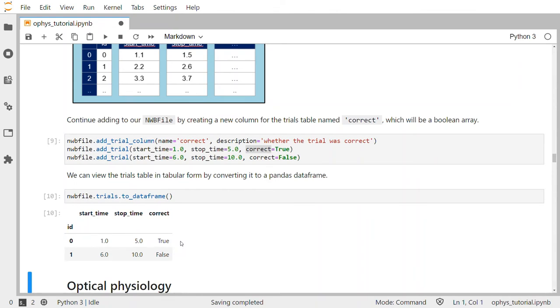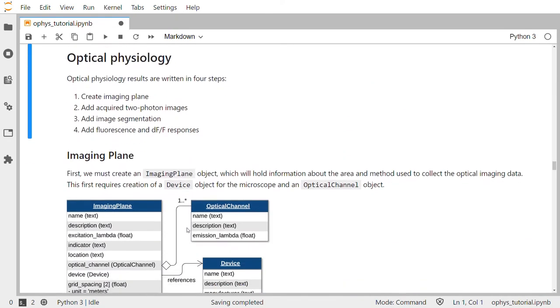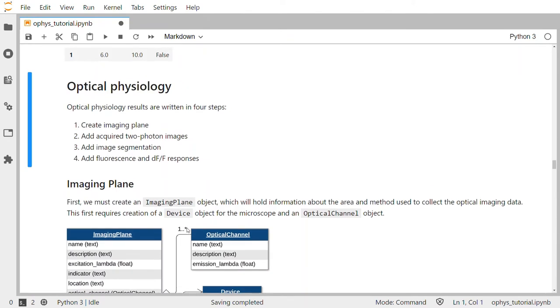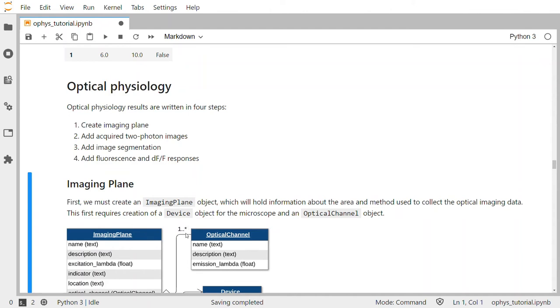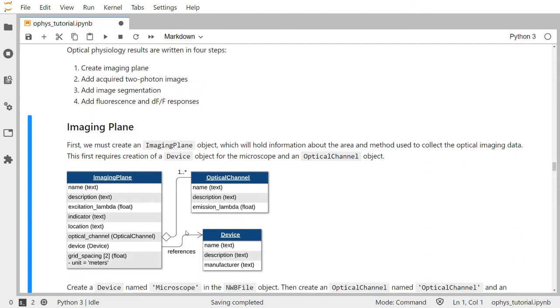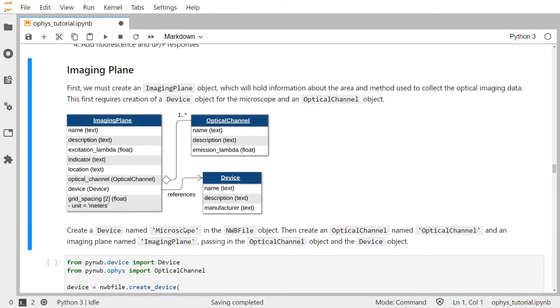Now let's store data specific to an optical physiology experiment. Optical physiology results are written in four main steps: first, we create an imaging plane that stores metadata about the imaging plane; then we add the raw acquired two-photon images; then we add the image segmentation results into ROIs; and finally we add the fluorescence or DF over F responses. So first, we must create an imaging plane object which will hold information about the area and the method used to collect the optical imaging data.